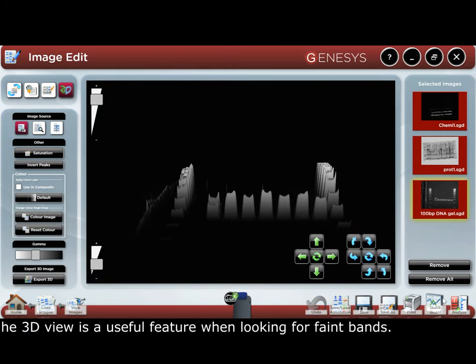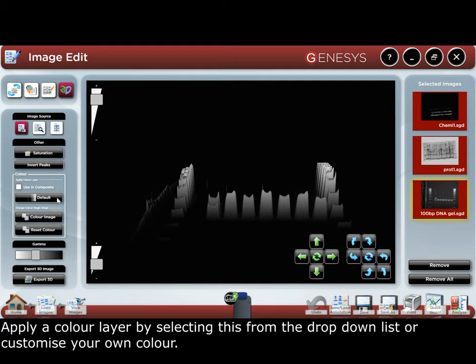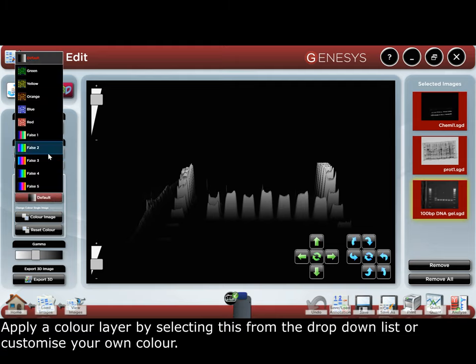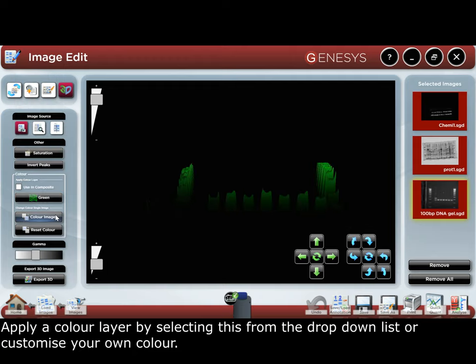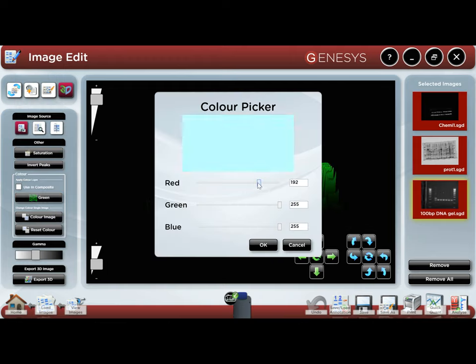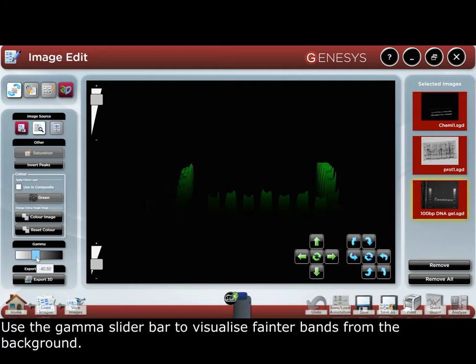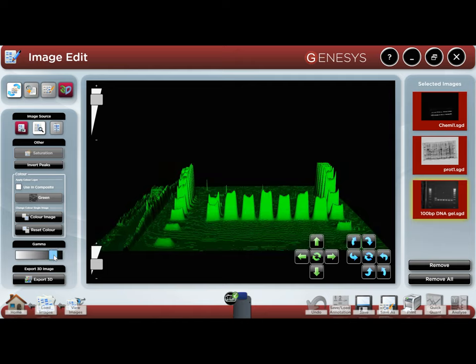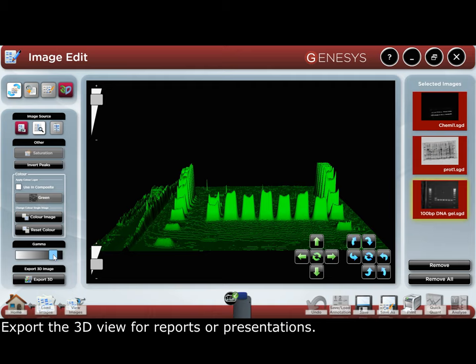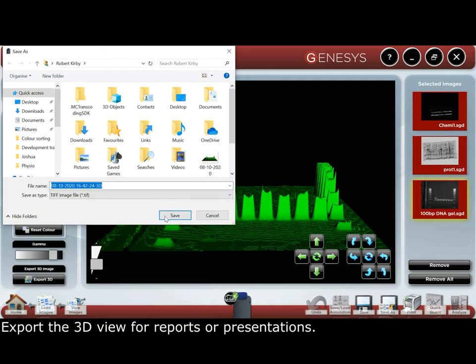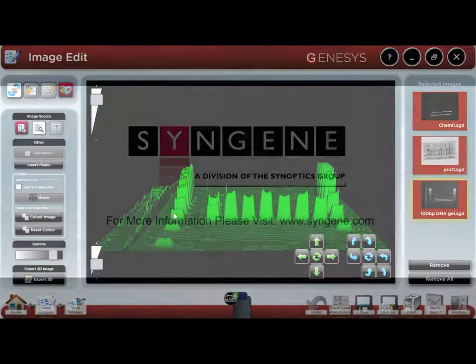The 3D view is a useful feature when looking for faint bands. Apply a color layer by selecting it from the drop-down list, or customize your own color. Use the gamma slider bar to visualize fainter bands from the background. Export this view through reports or presentations.